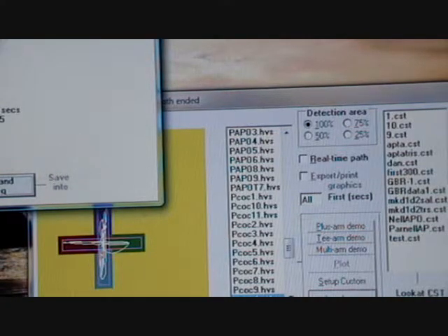So what we have is tracking, subject was my rat, description was testing, maze is 1 by 1, summary, so the total path that our ball moved is 3.77 meters over that 60 seconds. Average speed was 0.06 meters per second. Total entries 12. Visited 4%, path in arms 83.1%, time in arms 93. So it spent a lot of time in the arms. And then you can look at more specific by areas and whatnot. So it's quite a data-rich output.